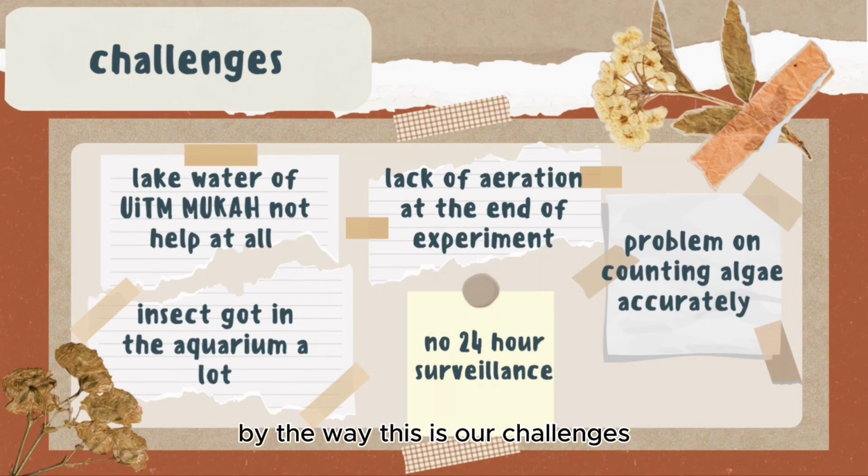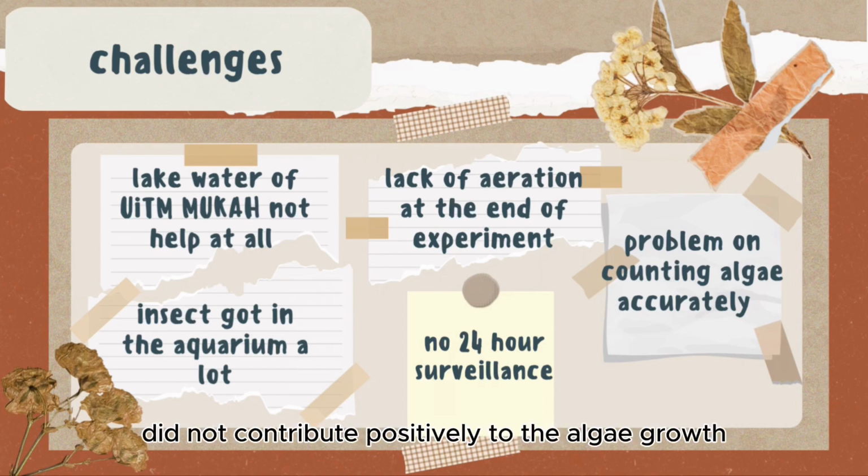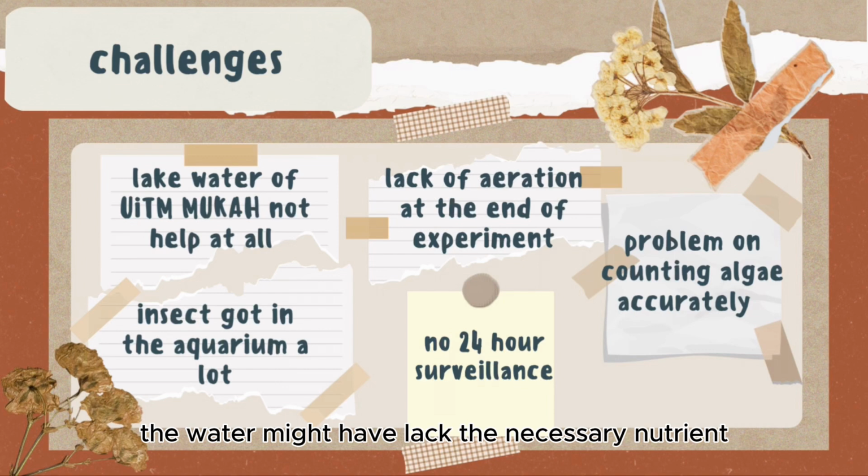By the way, these are our challenges. Now, let's talk about the challenges we faced during this experiment. First, the lake water from UiTM Muka did not contribute positively to the algae growth. The water might have lacked the necessary nutrients or contained elements that inhibit growth.